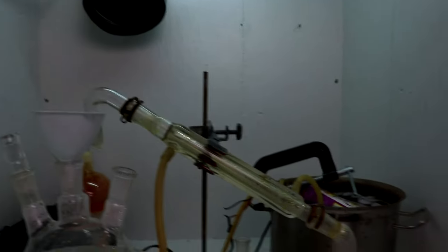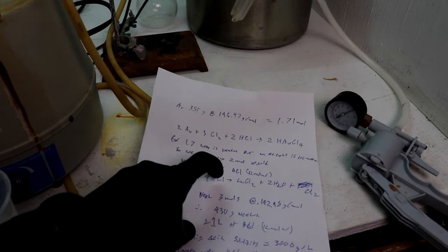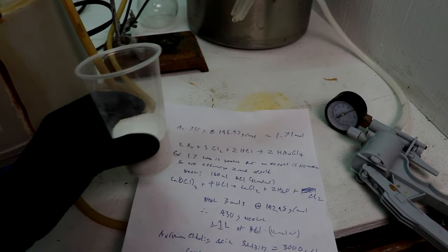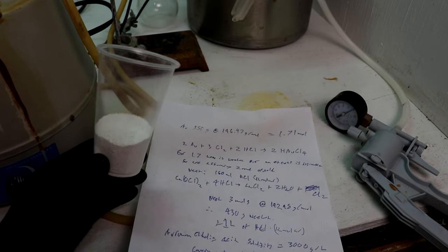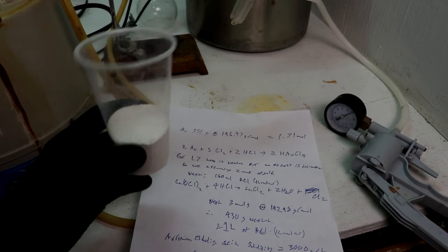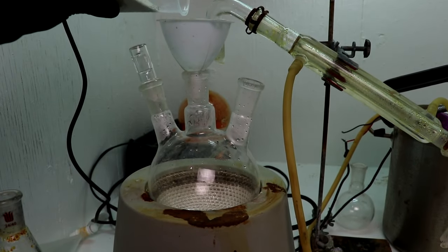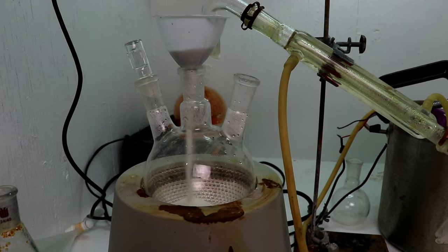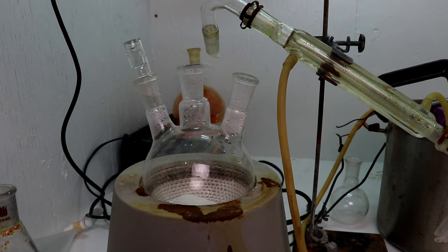Okay, so now's when it's getting fun. Got the fan going. Looking over my notes, this is the equation we're going to be using, except we're replacing this with hydrobromic acid, and it'll produce bromine instead of chlorine. And so I've weighed out 100 grams of calcium hypochlorite. Theoretically, I'd only need about 70 grams, but it's very impure, and basically I'm adding an excess, so I make sure I oxidize all of the bromide. Theoretically, any strong oxidizer could be used. The hydrogen peroxide I tried, and it did kind of work, but it really liked to froth up. So I'm just going to use this.